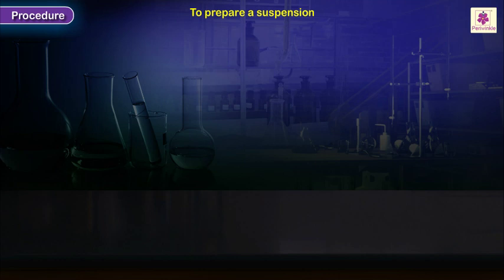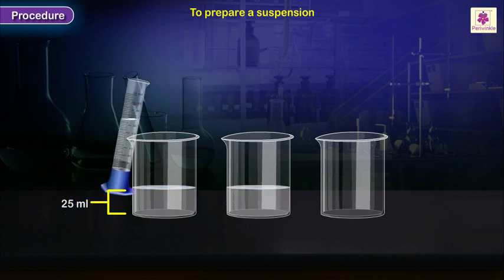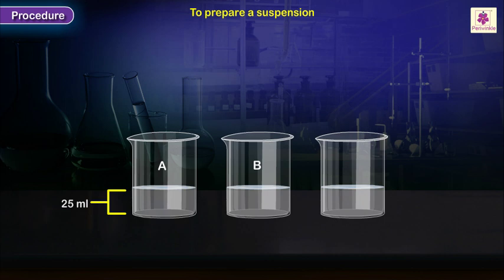Procedure: Take three clean beakers with 25 ml of water in each. Label them as A, B, and C.